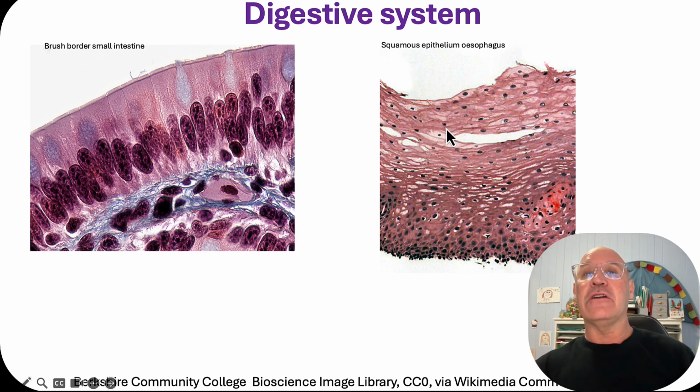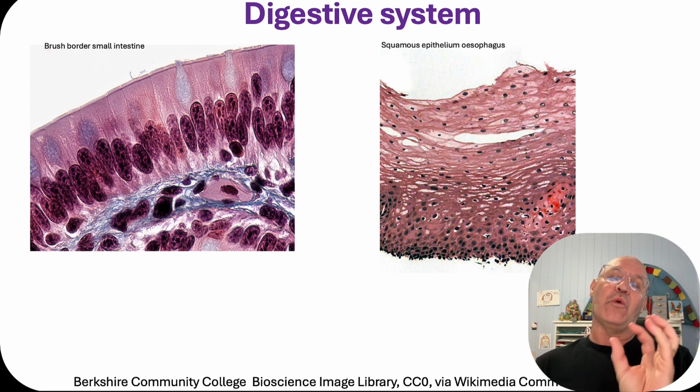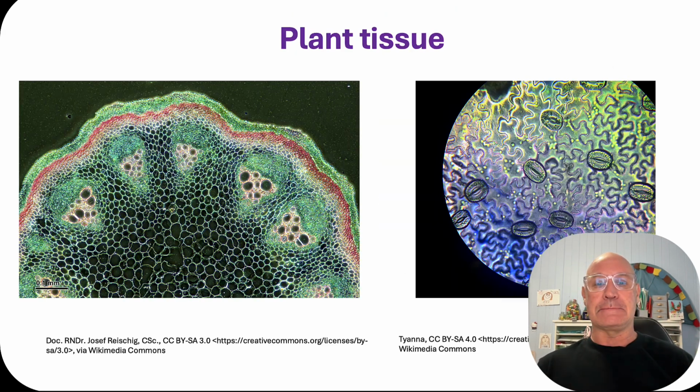So in the esophagus here, we've got flat epithelial cells that form the surface. There's an edge, and this is the lumen here, and then under this, again, we're probably going to have our loose connective tissue. So if we know the system we're looking at, and we know where we're going to find certain types of tissue, then it's actually not too hard.